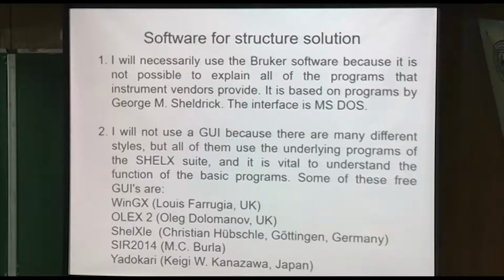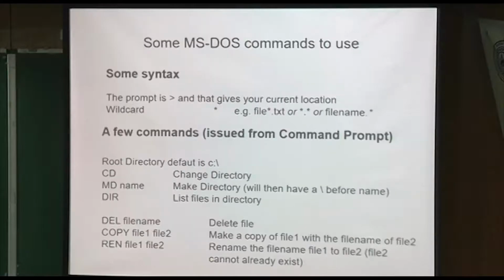So to avoid showing any favoritism, I'm just going to use the DOS command prompt. They're all using basically the same software underneath. Okay, so to use the command prompt, which was probably before you were born, right? There's a prompt, which is the greater than sign. And that's where your current location is, your directory. It's just going to tell you, like C:\, and that is your root directory.